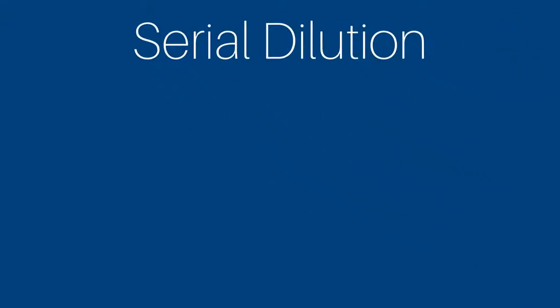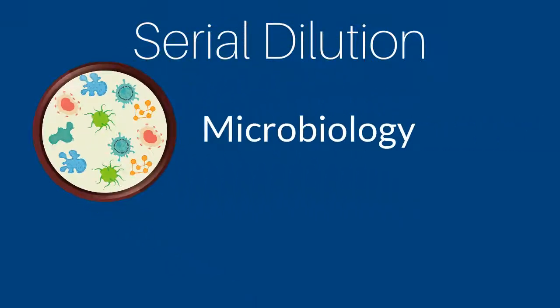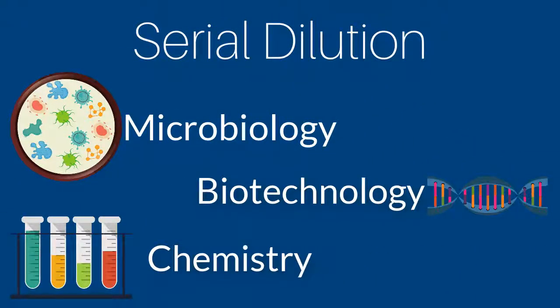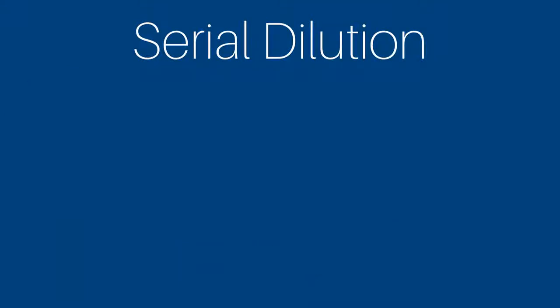Many areas of science use serial dilutions in preparations for different experiments. Serial dilutions are often used in the fields of microbiology, biotechnology, and in chemistry, just to name a few. Therefore, a clear and concise approach to the learning of this important concept is essential.